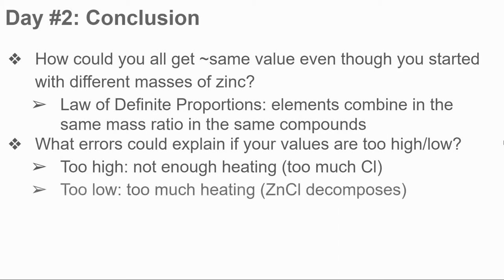Well, what if it was too low and you didn't have enough chlorine? Then you probably heated it too much, and the zinc chloride can actually decompose and turn into a gas. We're doing a phase change essentially if you heat it too long.